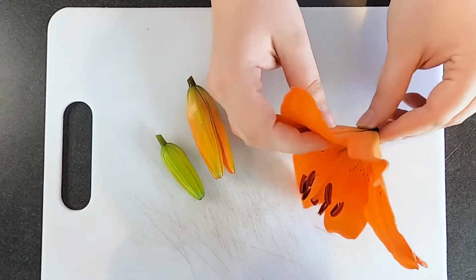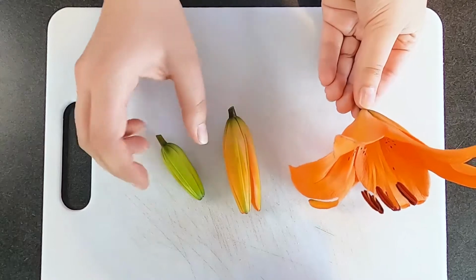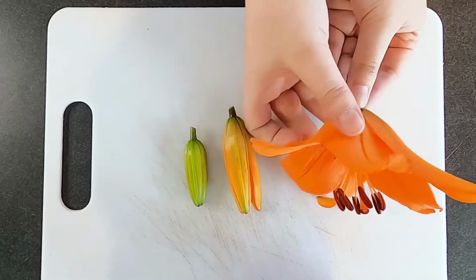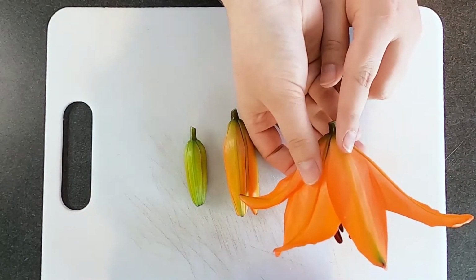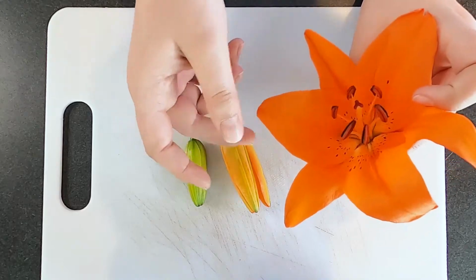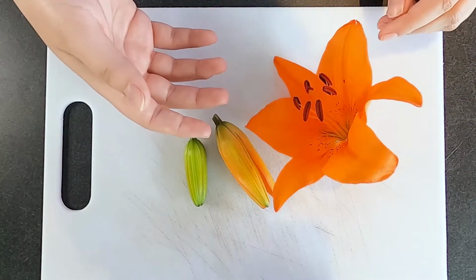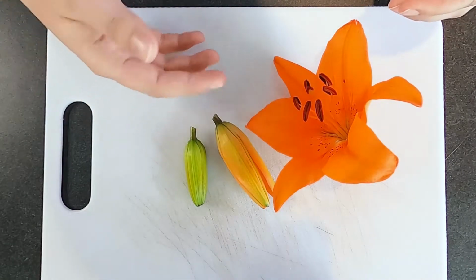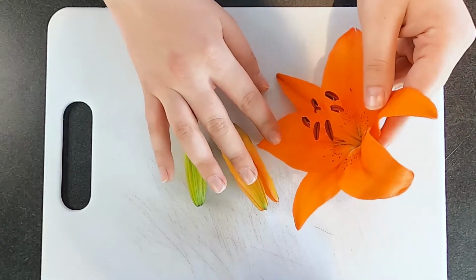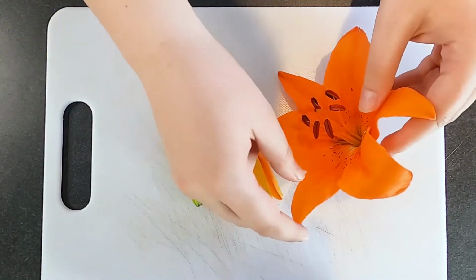So you can see on the flower, you don't really see any of these sepals. They actually are there. You can see with this nice progression that they actually turn color and match the petals. So any of them on the outside, this is a sepal, and the ones on the inside here are petals. So petals are very important. They change color, or they have this beautiful color for a purpose. And that's to attract a lot of those pollinators, because we need pollen in order to make our seeds. So we have this beautiful orange, but flowers come in all different shapes and sizes and colors, which is also very important.